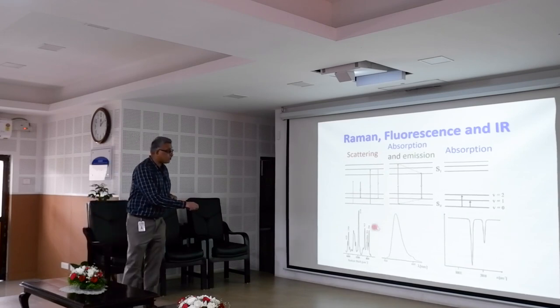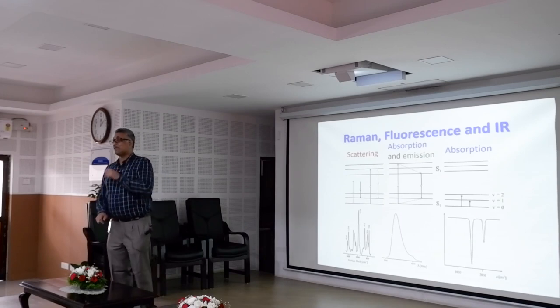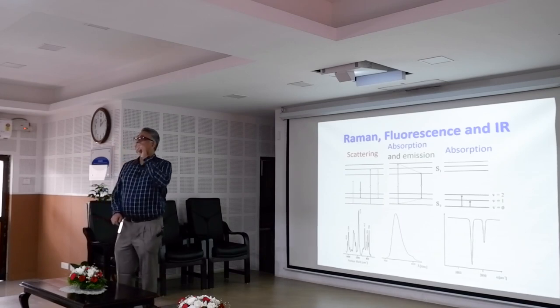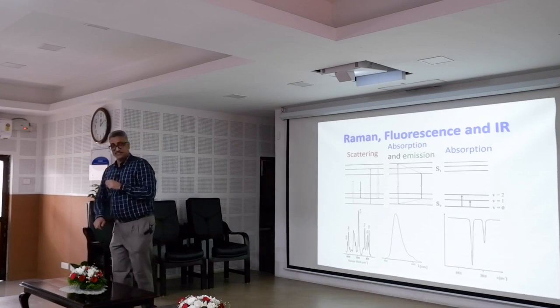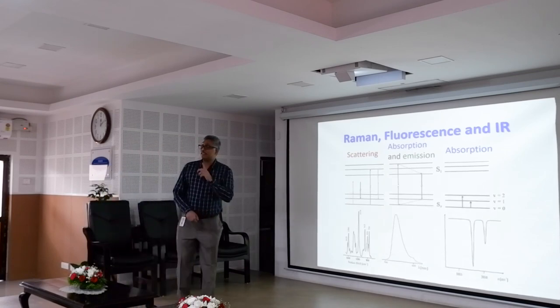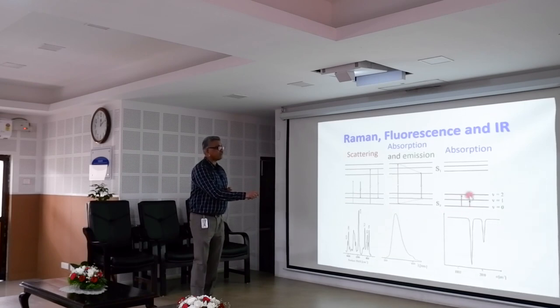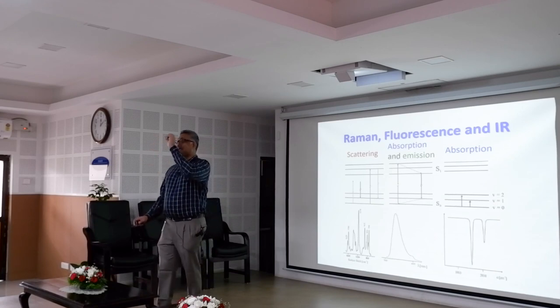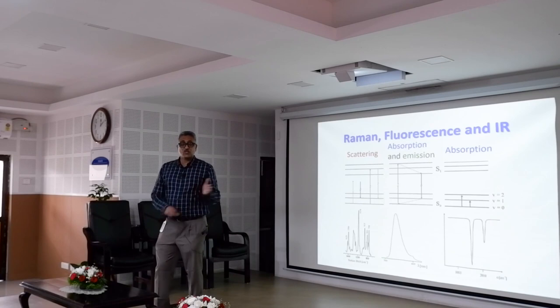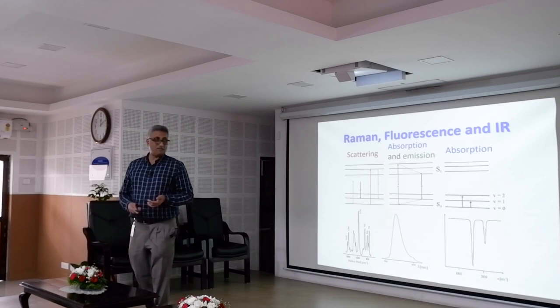But any time you expand the fluorescence, you will see Raman sitting on top of it. You can actually see that. But Raman is a weaker phenomenon compared to fluorescence. Because of that, you do not see this very nicely unless you have very good spectrometers. But in the case of IR, you don't even go to the higher S0 to S1. You only excite the vibration levels. That much energy is supplied directly. That is why IR is an absorption process. So you can see the comparison between all the three, and this is what you should remember.